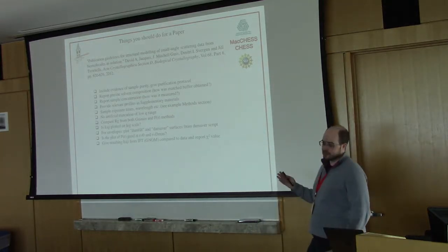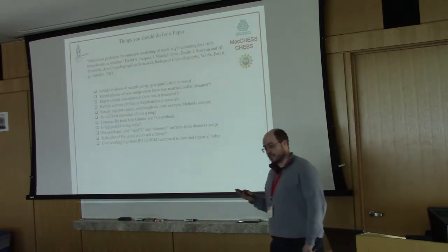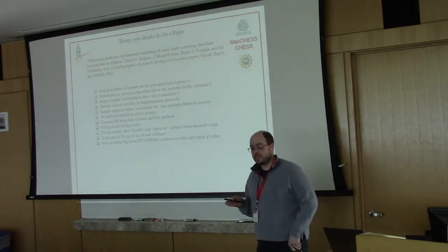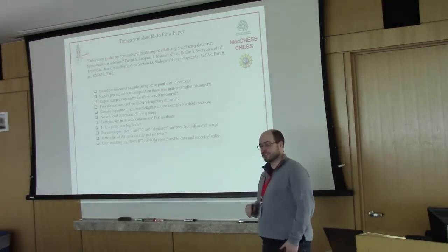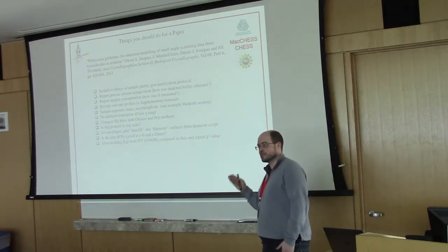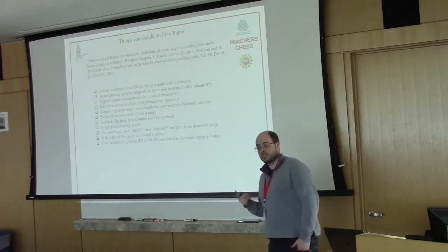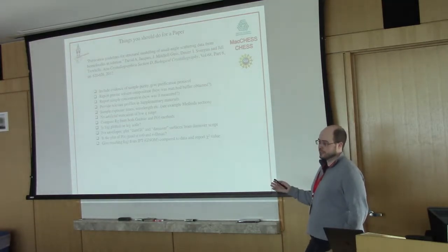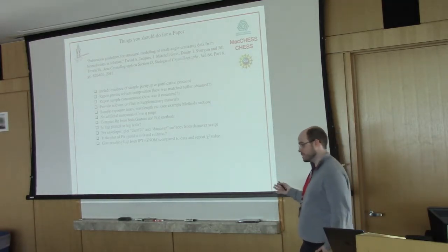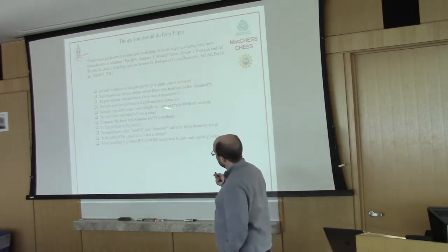So be honest about your data presentation, honest about what kind of sample quality you have. We'll see an example actually in the tutorials tomorrow, where even if you cut off the first few points of an aggregated sample and you get a beautiful looking Guinier, it still actually gives you a different Rg and a different molecular weight, and it affects all the downstream propagation. And so knowing that there was aggregation in that sample is very key to understanding what went wrong if someone's trying to replicate the experiment, for example, or even if you're trying to figure it out.